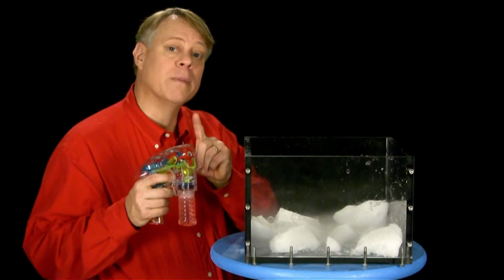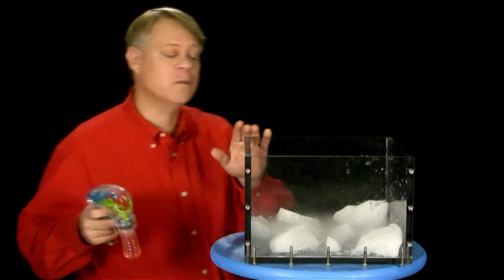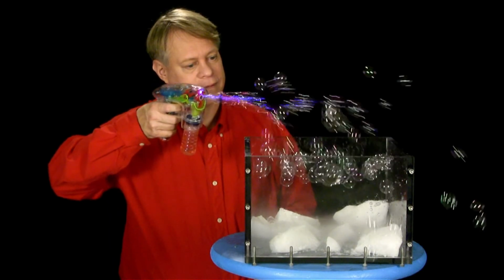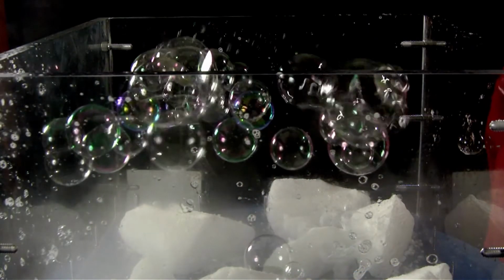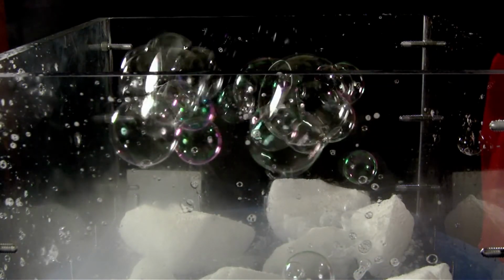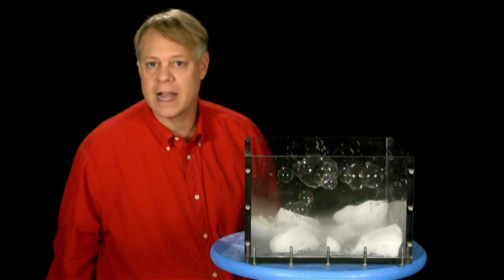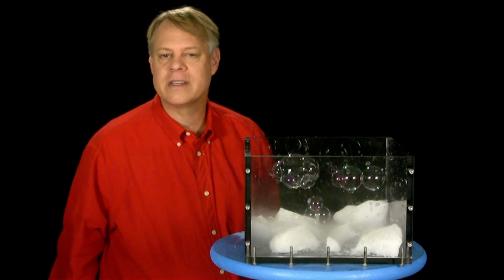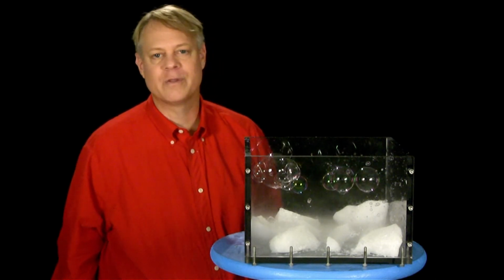Next is an experiment where I will show you its density. If I blow soap bubbles, which of course are filled with air, into this container filled with carbon dioxide, they will float. They are floating by virtue of the greater density of the carbon dioxide than of the air. And now, having so far given you the history of carbon dioxide as to its sources in the candle, as to its physical properties and density, in the next lecture I shall show you of what it is composed and where it gets its elements from.